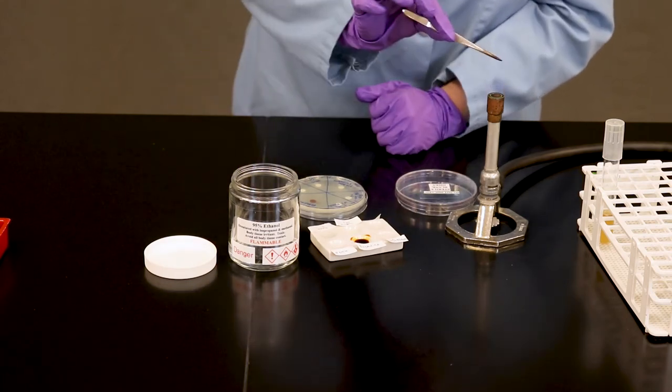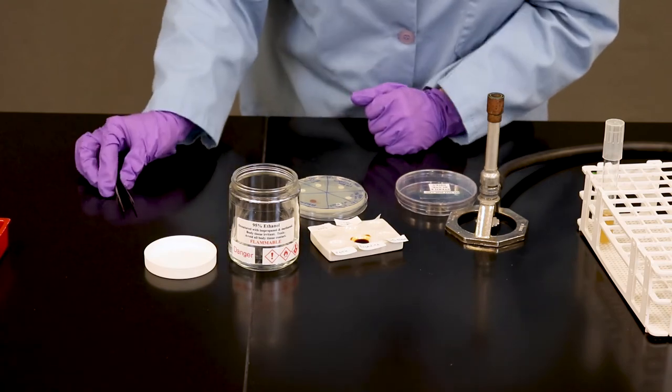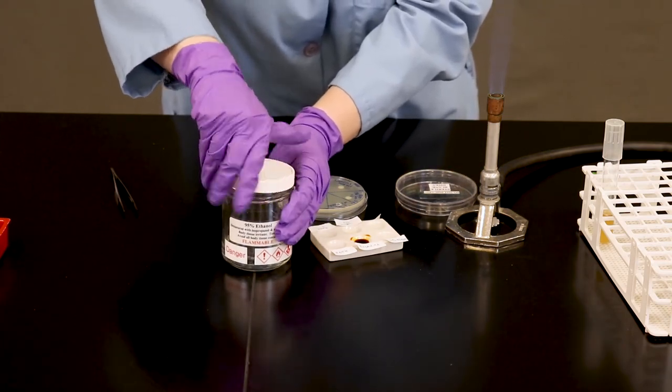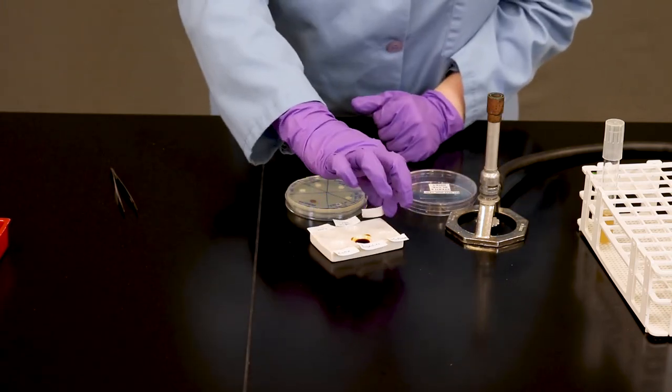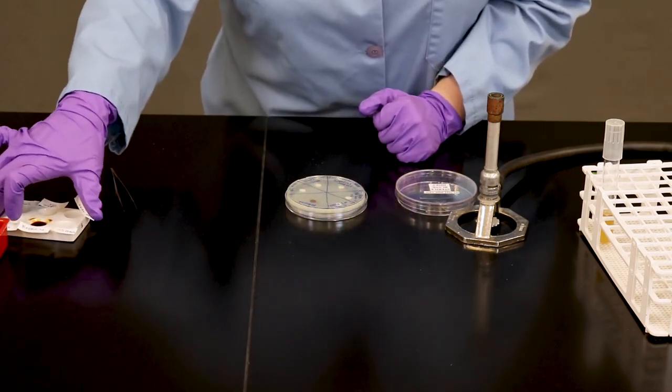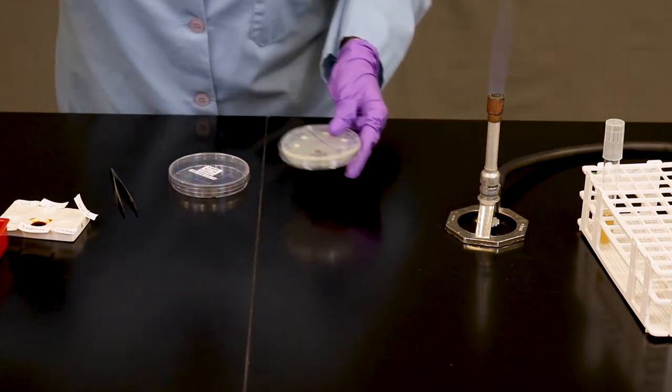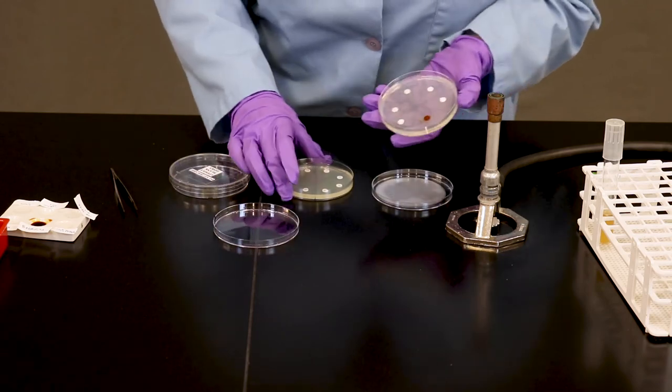Be sure to flame one last time before putting your forceps away. Cover your alcohol, get it out of the way from the Bunsen burner. You'll see a disposal area to replace all of your disinfectants. This is essentially what your final steps when you're done should look like.